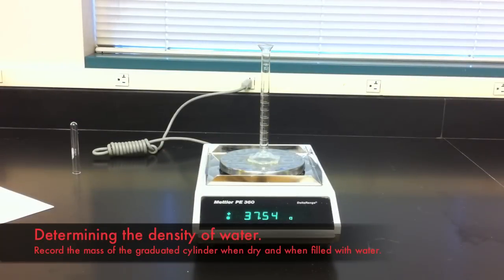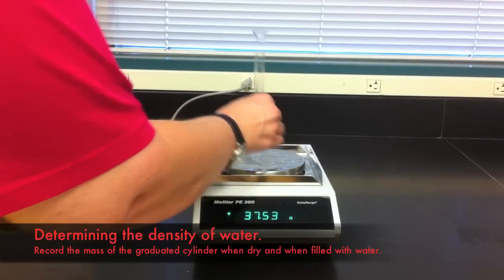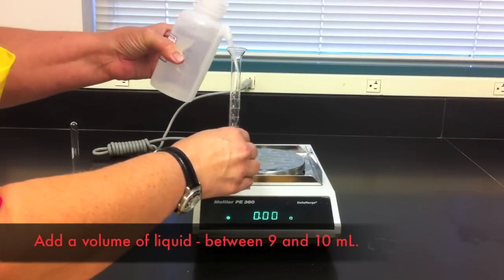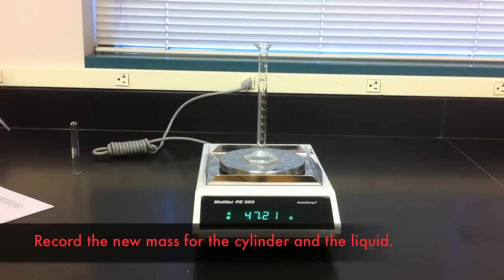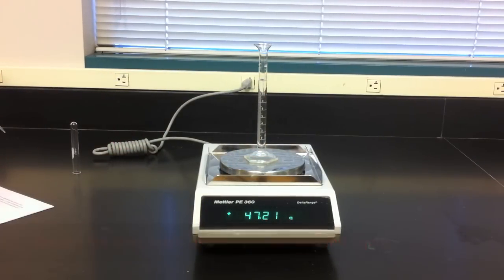Next you're going to test the measurement of the density of a liquid. For our purposes we'll start with measuring the density of water. First you'll need to measure the mass of a graduated cylinder, then fill it to about 9 or 10 milliliters of volume and record the mass once again.